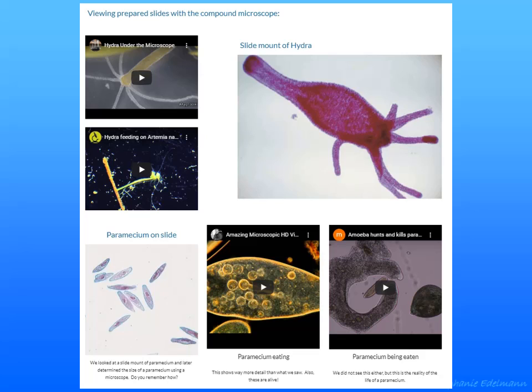So when you're trying to focus on any kind of item, you usually are looking for the colored thing, and then you're zooming in from the colored thing. If you're playing around with the virtual microscopes, that's actually something that you can do pretty well. You can just pick any kind of sample and try to find your way to the sample by just starting to look at color and then trying to see how far you can get.